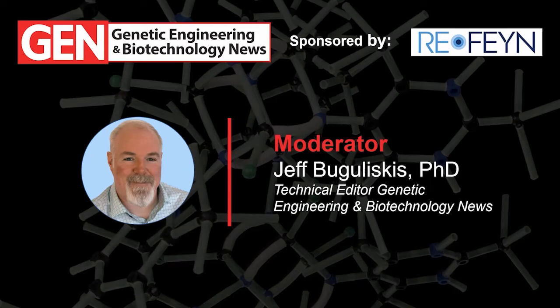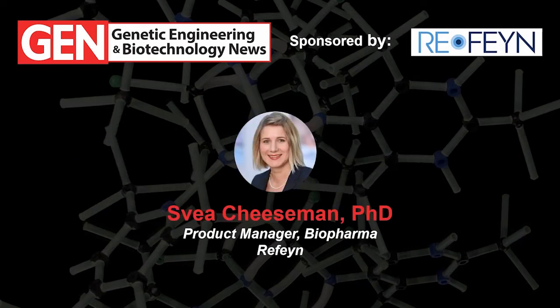Well, in today's webinar, we're going to learn about mass photometry technology and how it's being tailored to address the challenges of AAV characterization. Here today to tell us more about mass photometry is our presenter, Dr. Svea Cheeseman, who is a product manager at Refeyn, responsible for products targeted at the biopharma industry.